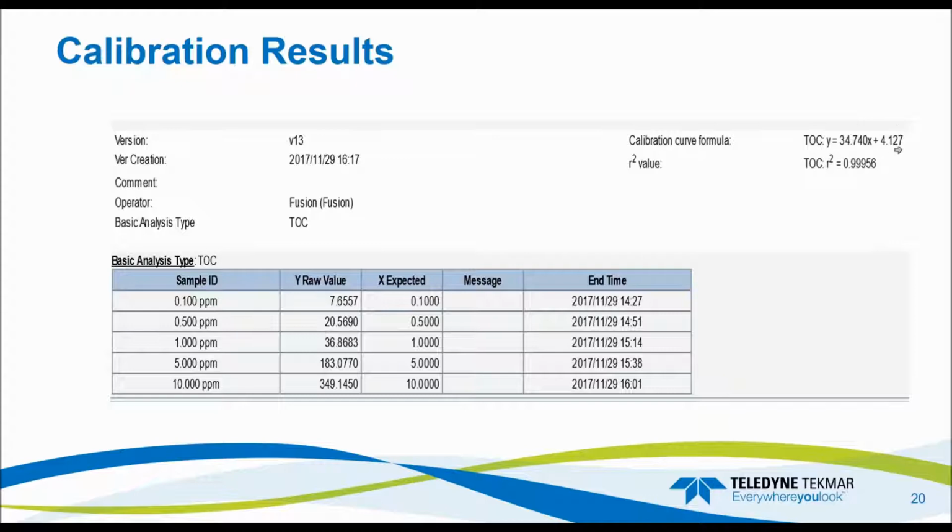Also make sure that the B value is never above 8. If you have an 8 as a B value, that means there's too much contamination in the system. So keep an eye on that. Make sure it's nothing above 8. Okay.